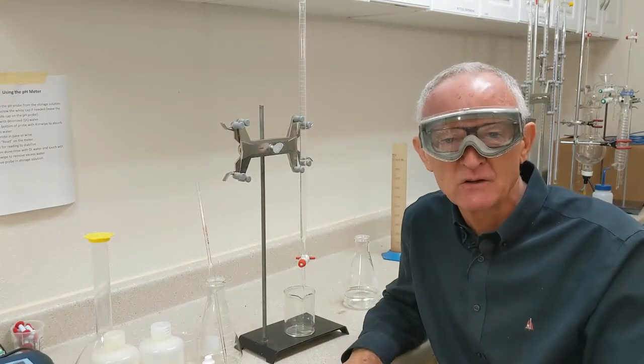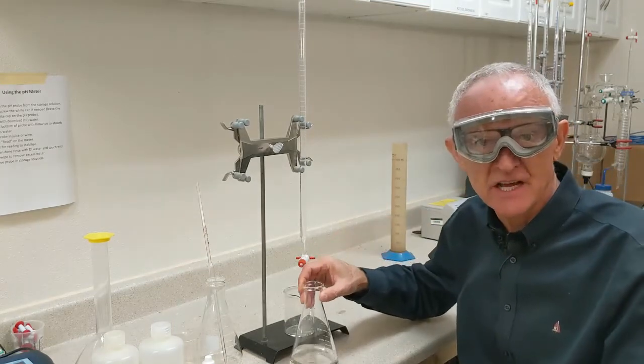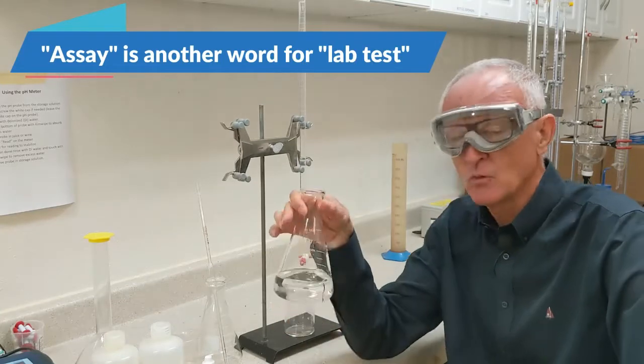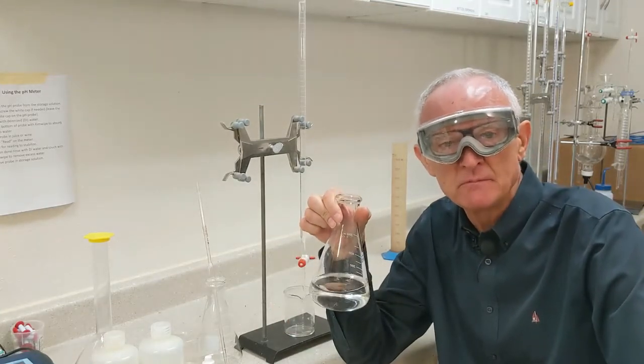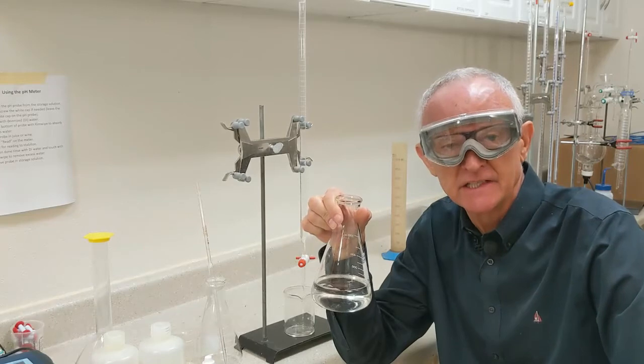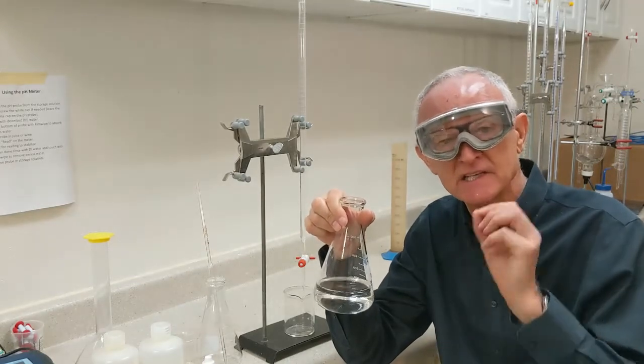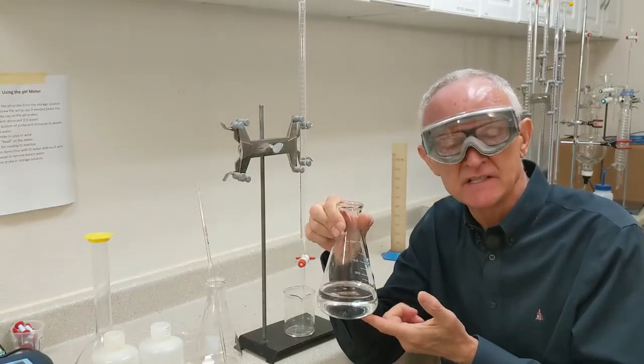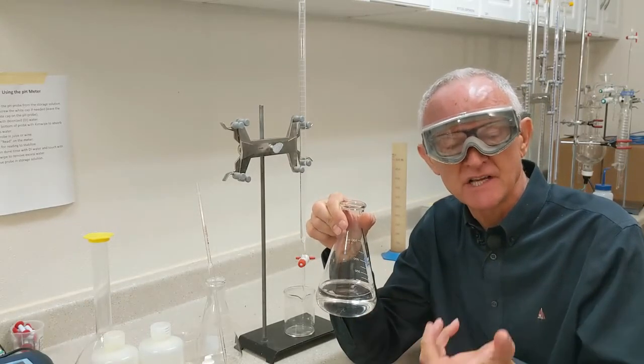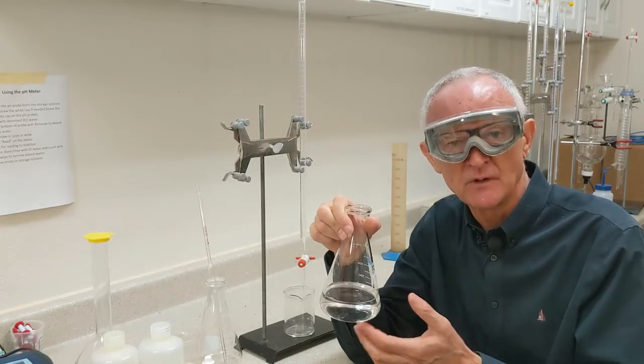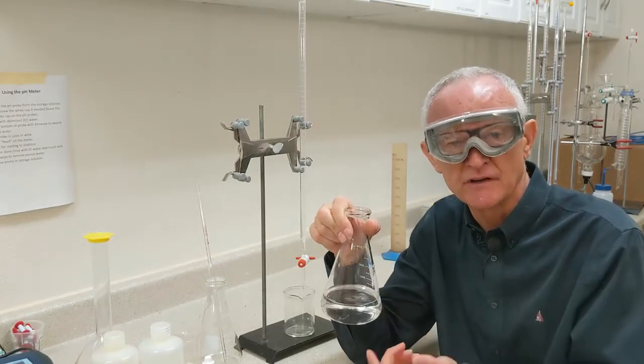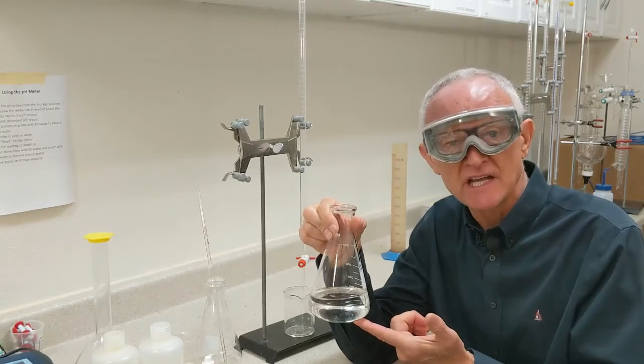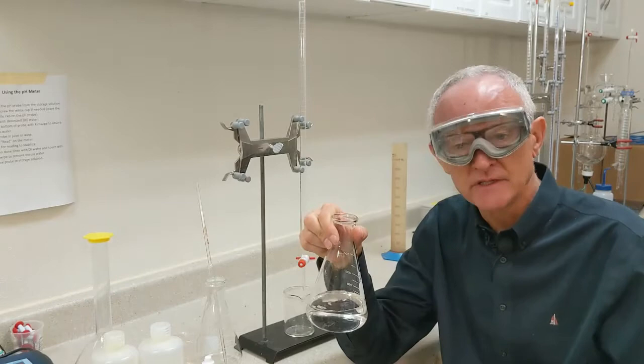Now before I add wine to my flask to actually do the assay, we have a problem. We put water in here, that water might have some acid in it. In other words, it might not be neutral, it might be slightly acidic. And so we need to get rid of any acidity in here before we add our wine to test the acid in our wine. We don't want acid from the water interfering with the test of acid in the wine. So I'm going to neutralize any acid in here by adding a little bit of sodium hydroxide.